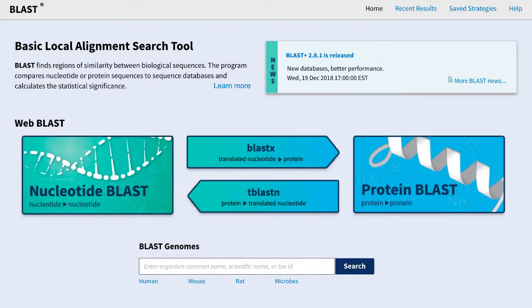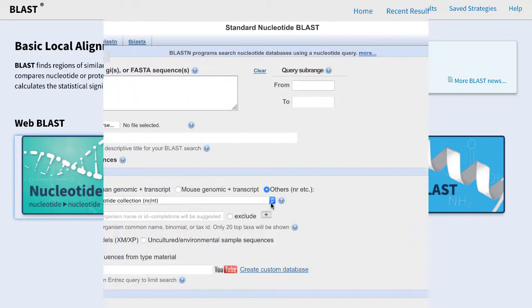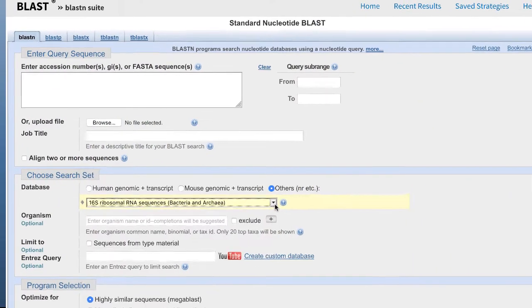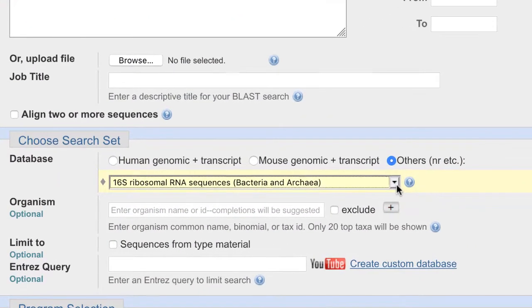Starting on the BLAST homepage, go to Nucleotide BLAST, then select the database 16S Ribosomal RNA Sequences for Bacteria and Archaea.